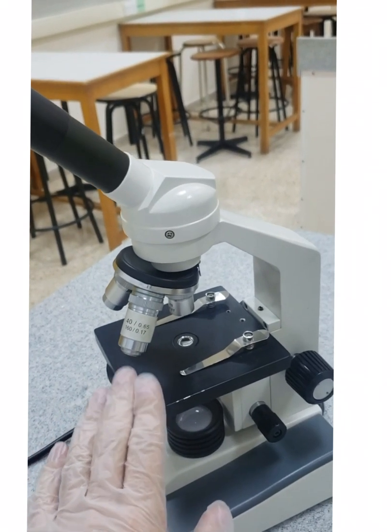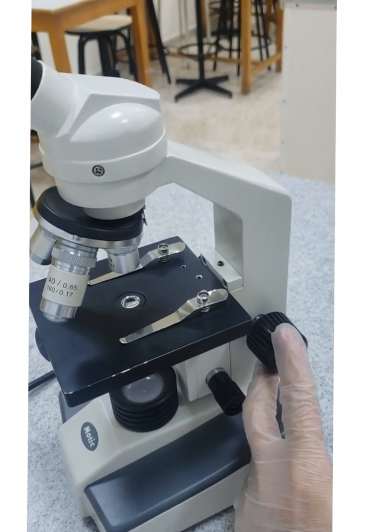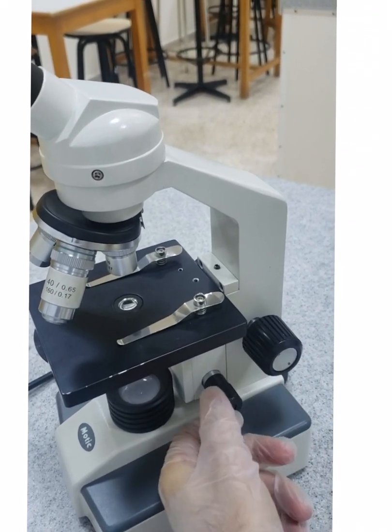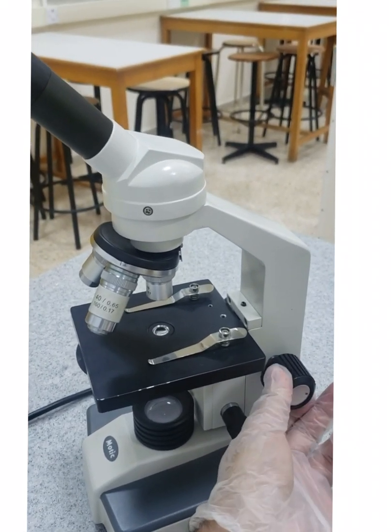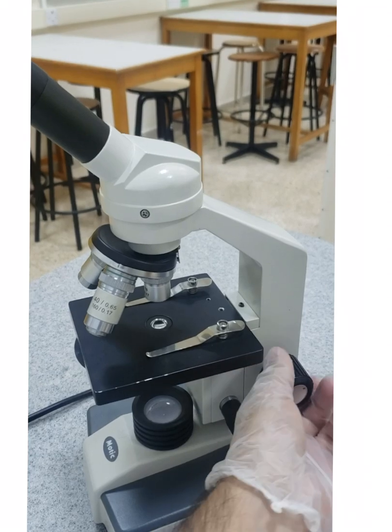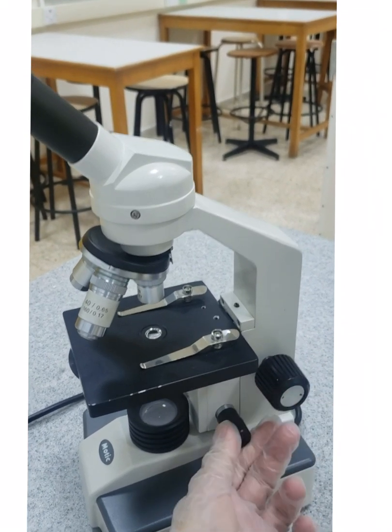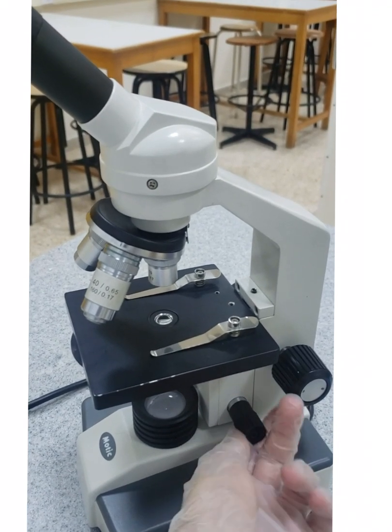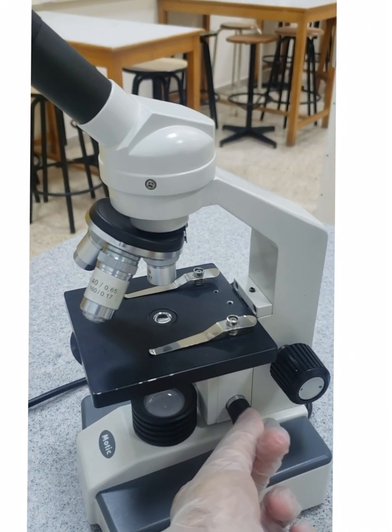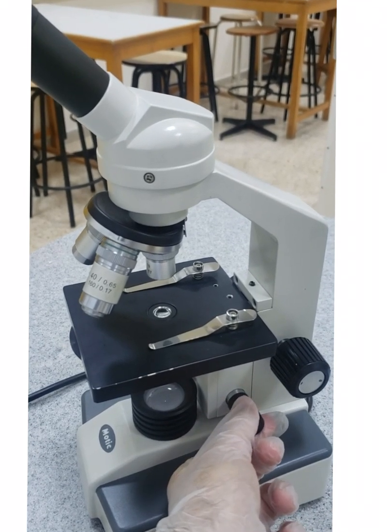This stage can go up and down using these two knobs, the coarse adjustment knob and the fine adjustment one. The coarse adjustment one can take the stage up and down in a very fast way, as you can observe here. But the fine adjustment one, look, I'm taking the stage up. Look how hard it is. It goes in a very, very slow manner.